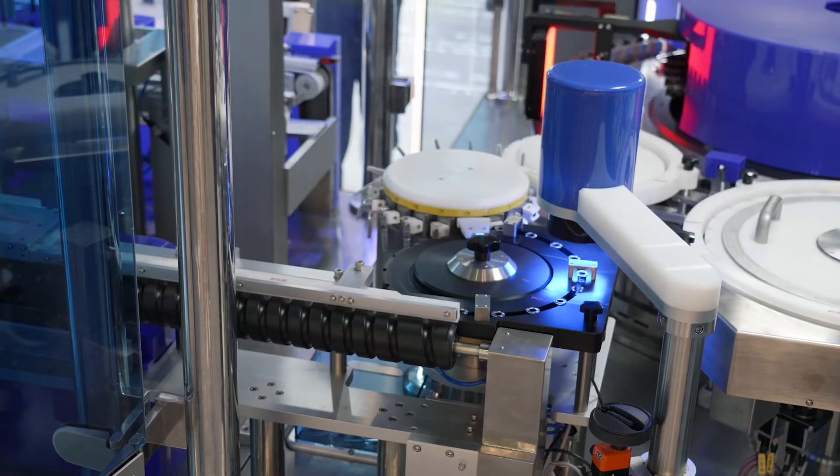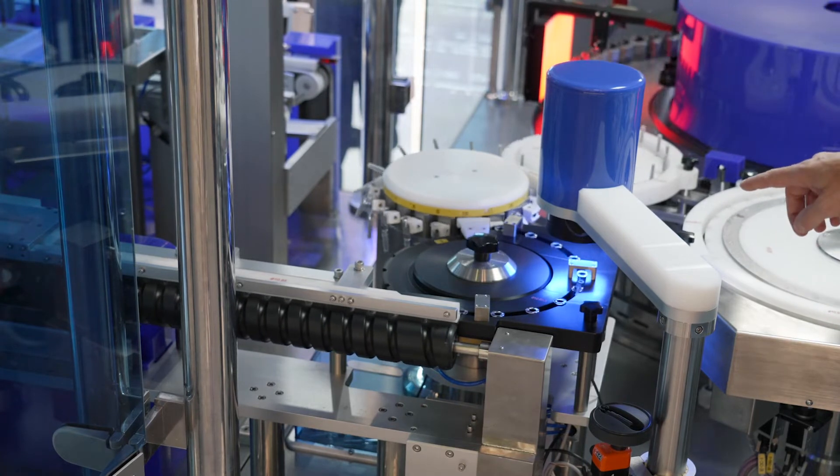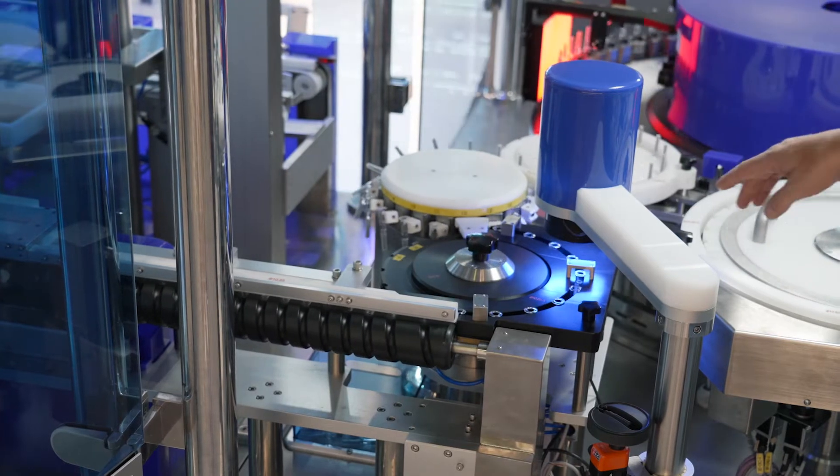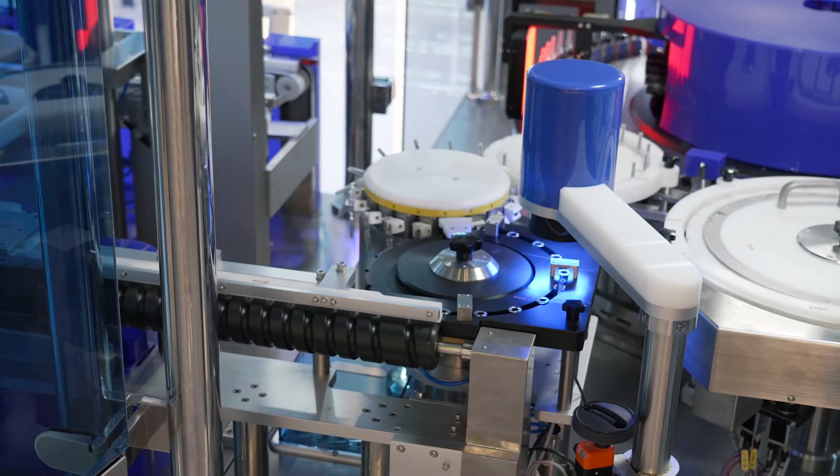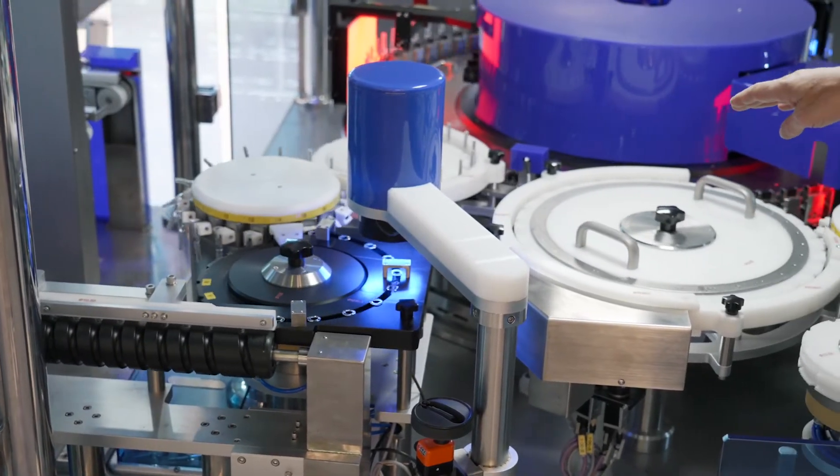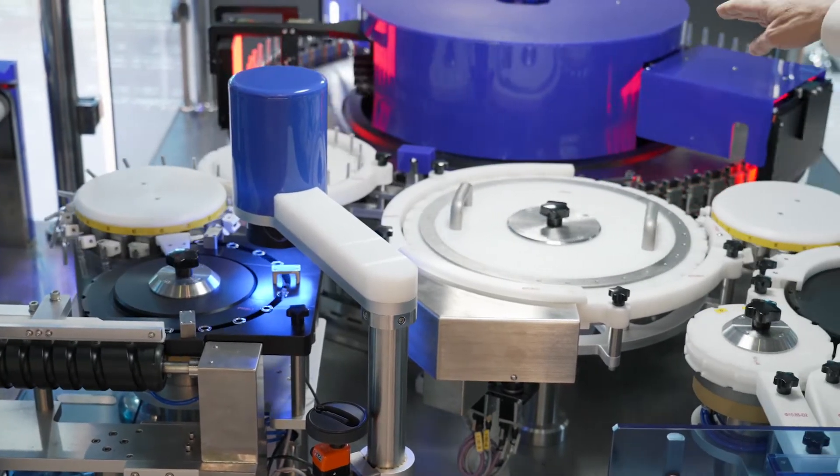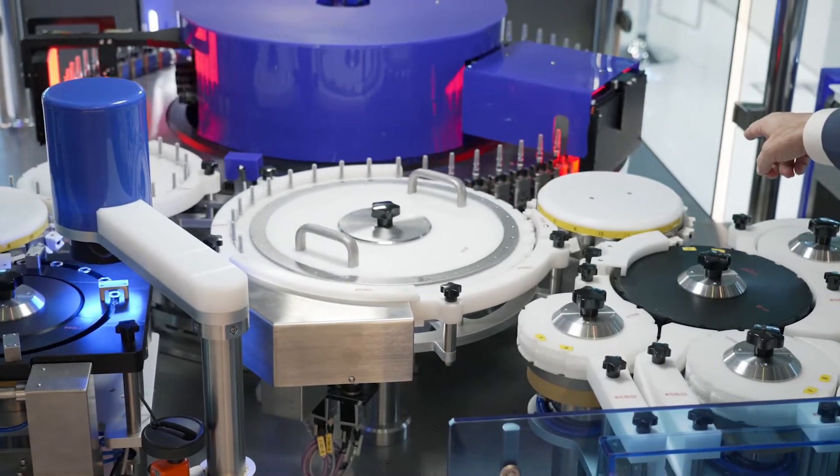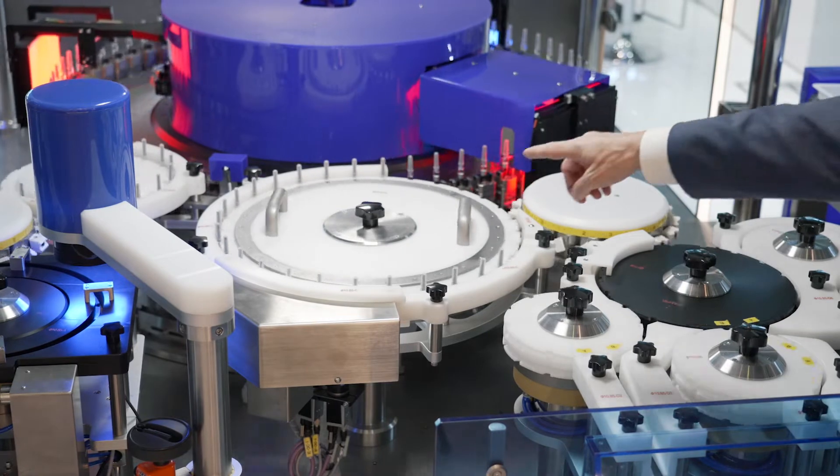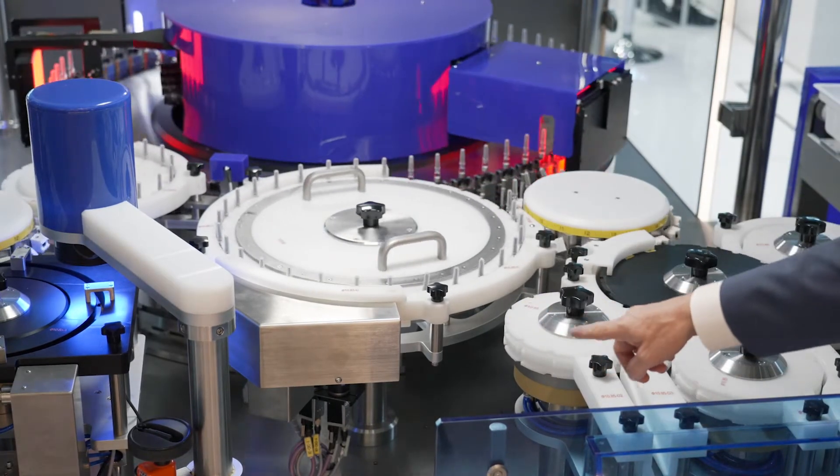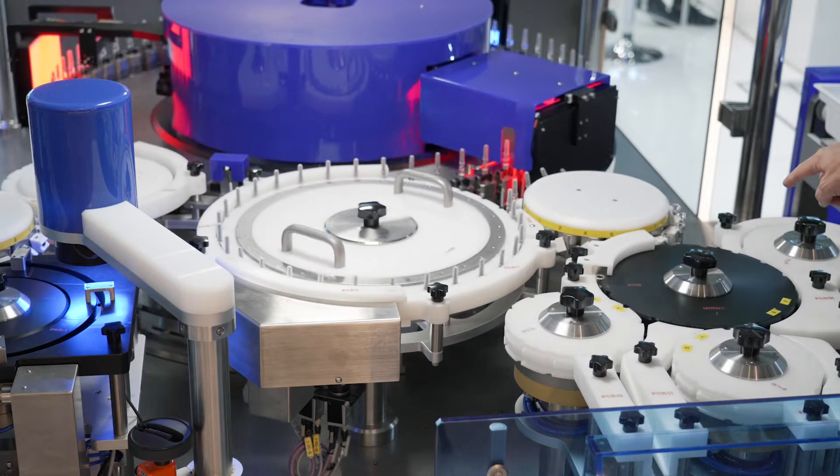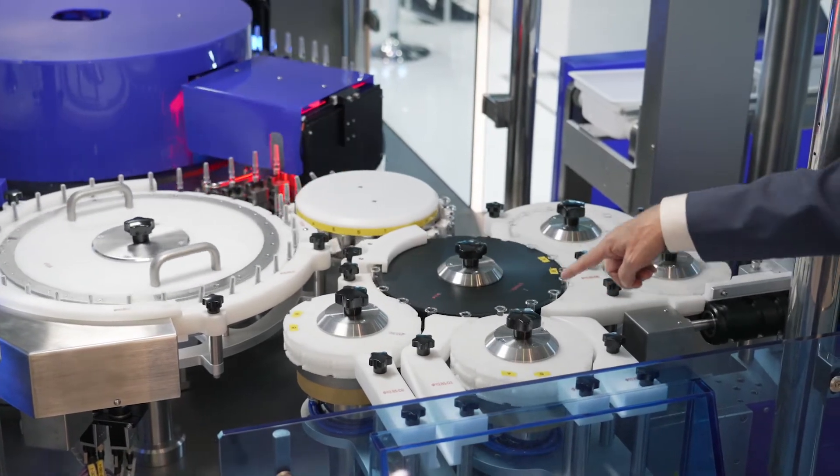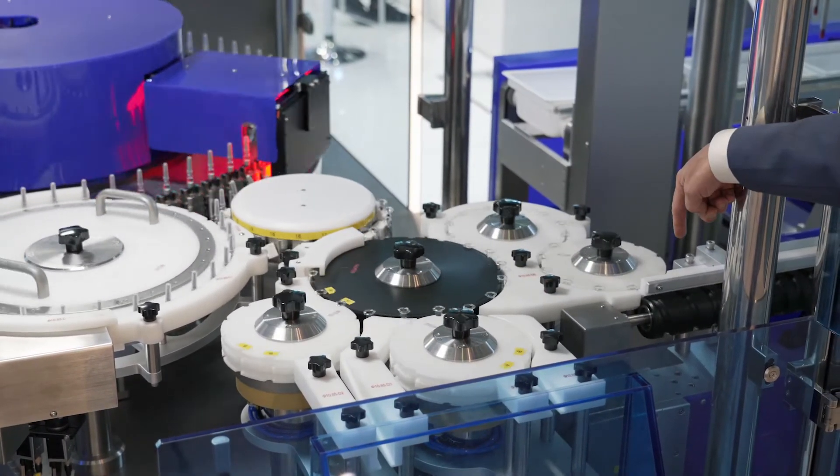In the inspection area, first we have the inspection of the flange of the syringe. We will remove all broken flanges so that the next container can enter safely the star wheel for inspection. We have the cosmetic area first, the first particle inspection, the needle shield inspection area, and the second particle inspection. Then the container undergoes an inspection of the bottom and they are turned again. Finally, we have the sorting area where the bad containers are removed from the stream and the good containers can move on to the next step.